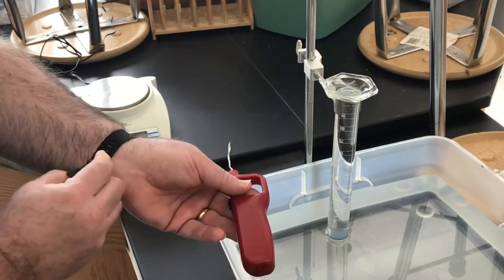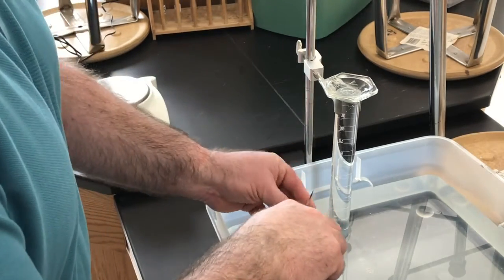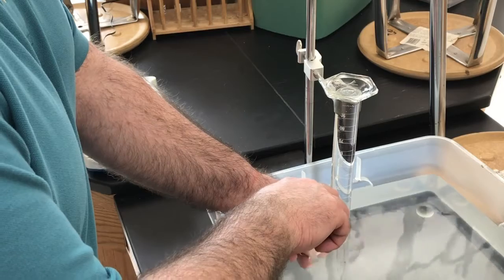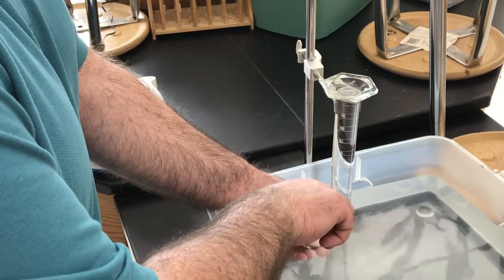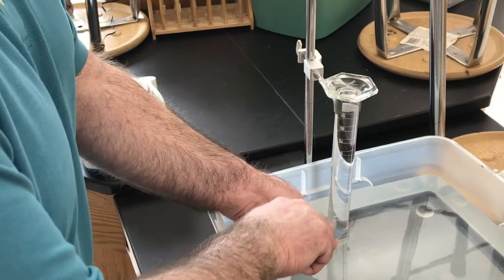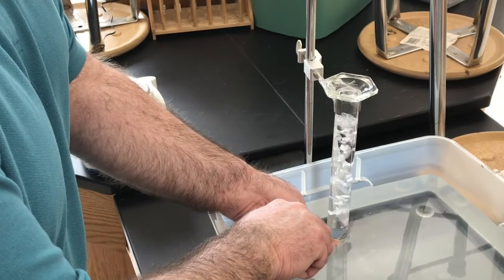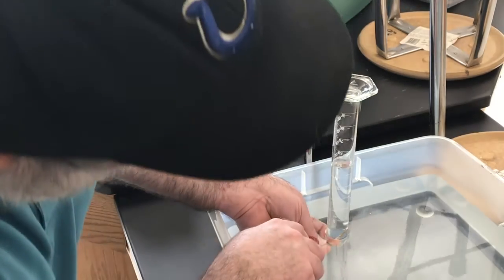All right, so let me go ahead and see if I can do this without making too much of a mess. Take my watch off here. I want to try to not get this wet as much as possible. Just get the hose wet here. All right, let's stick that underneath. And you can see as I release the gas, it goes straight up in there.